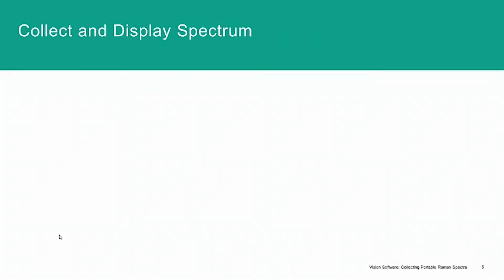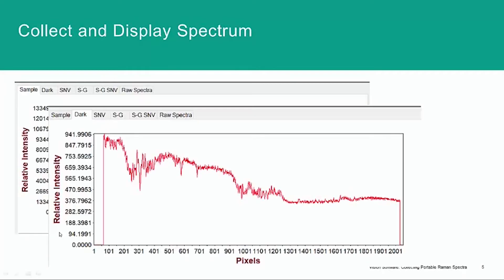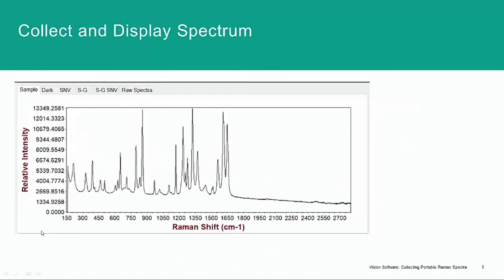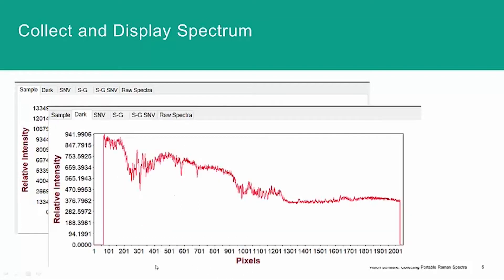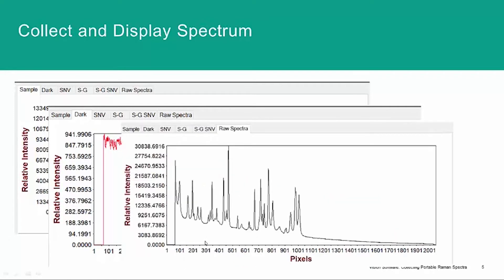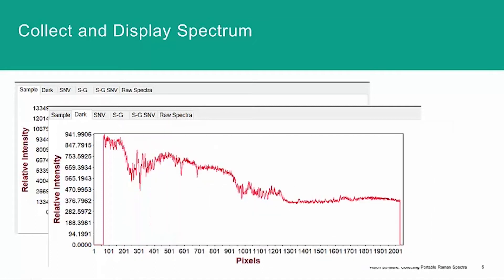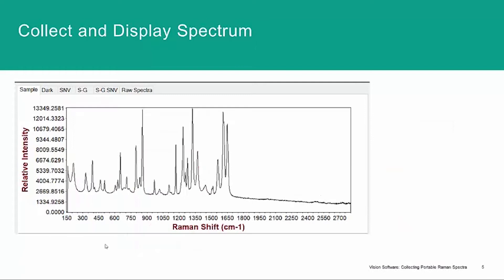When you collect a spectrum, the final spectrum will be shown and plotted as the relative intensity versus the Raman shift. But in addition to the full corrected spectrum, you'll also have the ability to view the dark spectrum and the raw spectrum for an immediately collected scan. Those will not be saved, and the final spectrum will be saved as the relative intensity corrected and dark subtracted scan, as shown here.